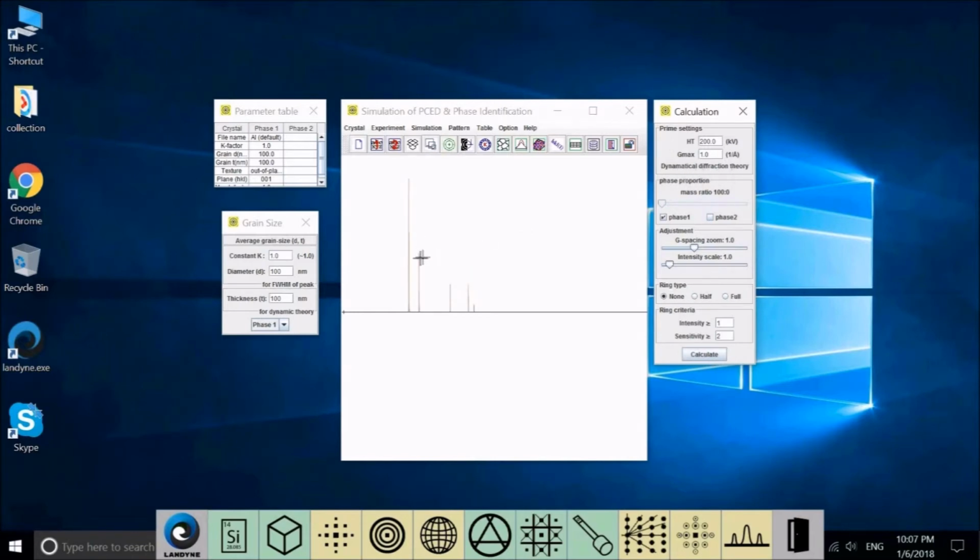Now let's look at this phase peak height and select it here, kinematic diffraction, and do the calculation, and pay attention to this height. Reduced. The other heights also change slightly, and for the simple aluminum phase, it shows slightly different results for the dynamic and kinematic.